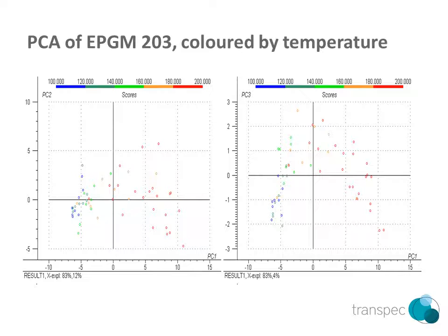The graph above shows two different principal component representations of the epoxy material data. It shows the breakup into temperature families. From this we can measure the temperature regime, and then from there the time the material has been aged for.